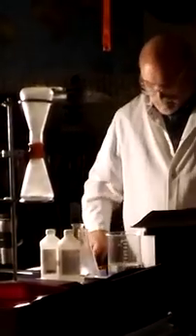Okay? You remember the density column with the syrup and the soap and all those things? Okay? The alcohol was the least dense of those fluids, and therefore it migrated to the top of the container. Well, you can't see it, but the hydrogen is collecting here. It's the least dense. And we're going to give it just a little bit more.